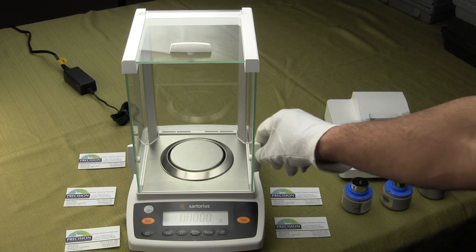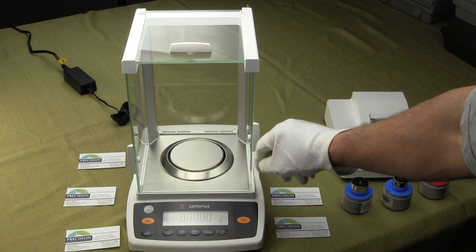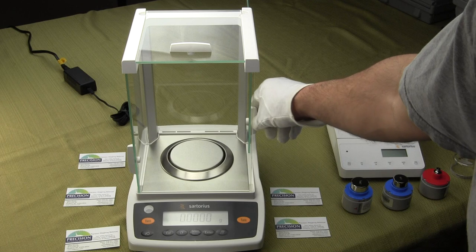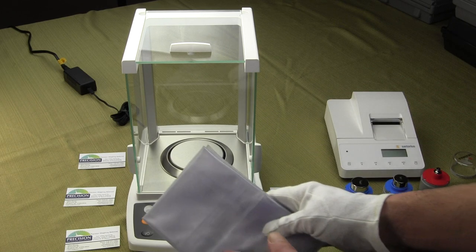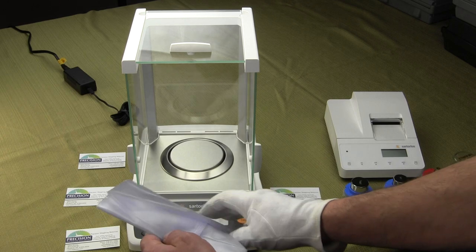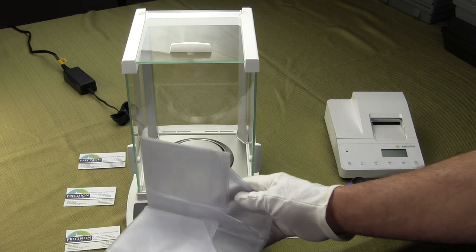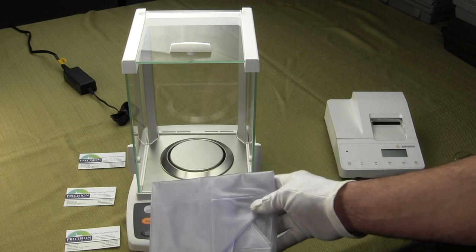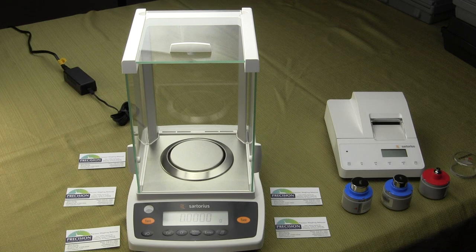But you can take off these doors and wash them by unscrewing the little knob on the back of the handle. This glass would come out if you wanted to put it in the dishwasher. The balance comes standard with a dust cover. This plastic dust cover can be placed on the balance when not in use. This is standard with the Entris analytical series.